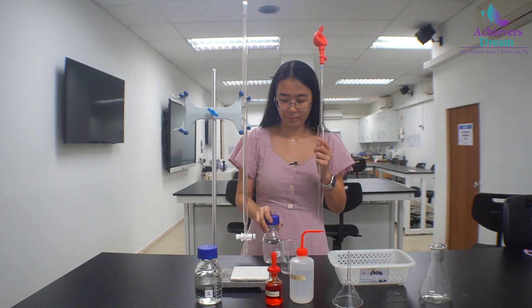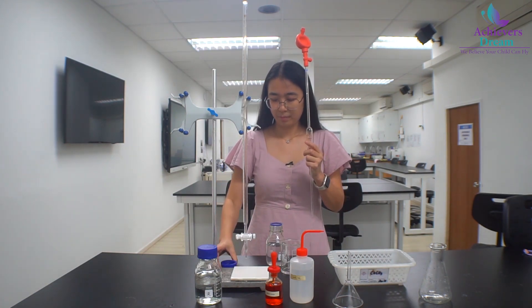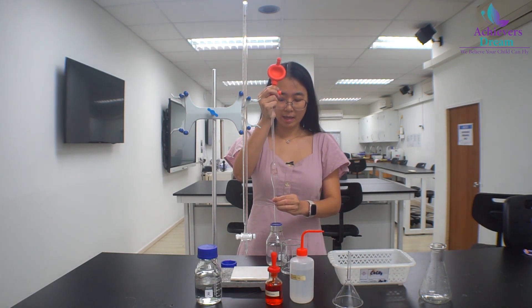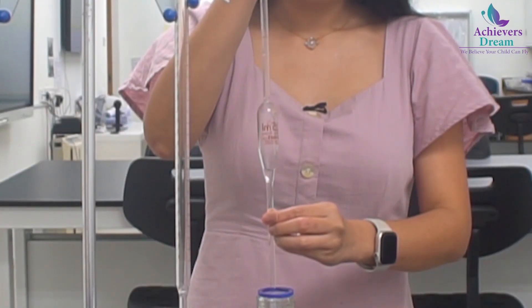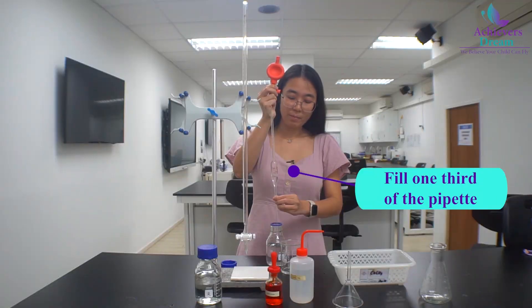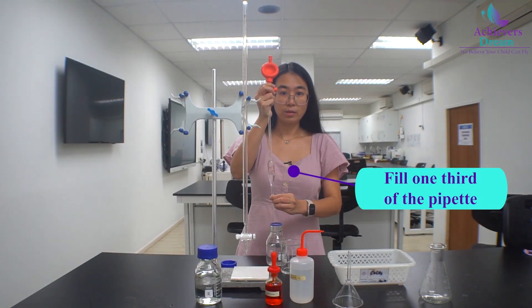Now take solution Q and place the pipette into the solution and press S to suck up the solution. Fill the pipette halfway because we just want to rinse the solution.